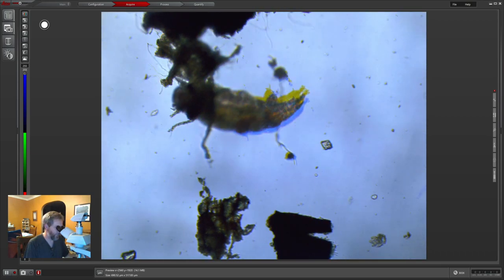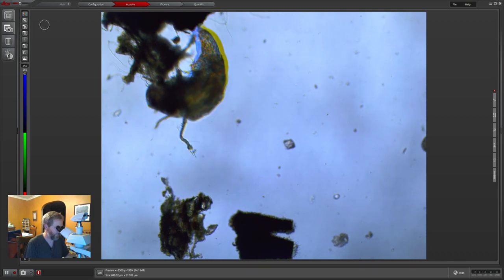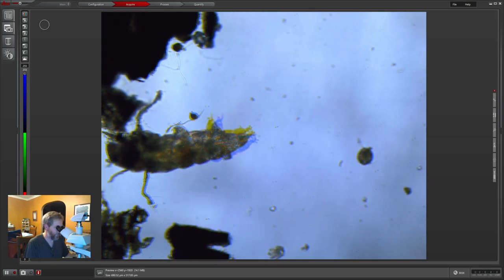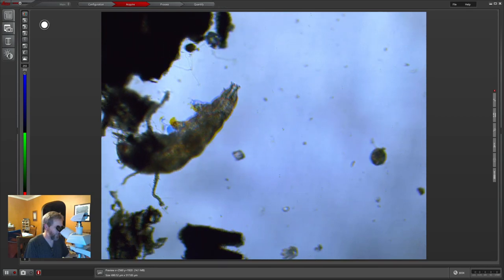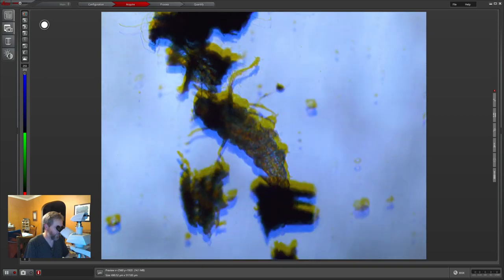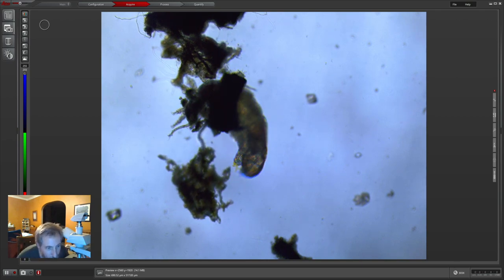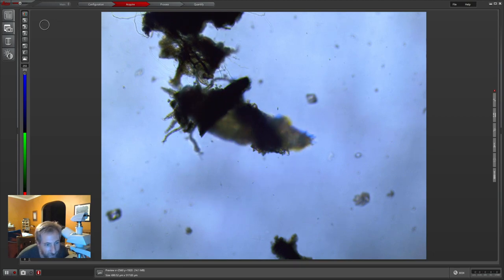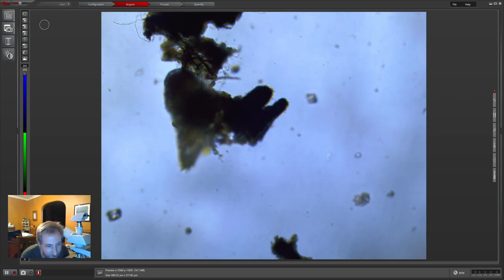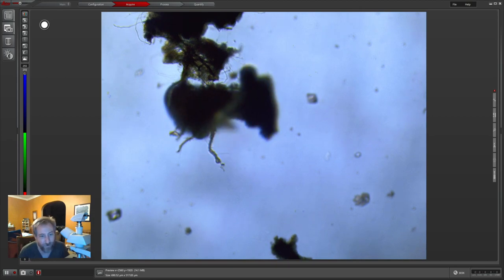Here's the actual water bear. You can see it's a little bit different than the kind we had before. It's got sort of a five- or six-star shape around its face, and then two little antenna-like structures coming off of its cheeks. We saw ones like this that were really small in one of the samples from my yard once, but this one is huge relative to those. You can really see it moving around. He's got little baby claws, and a little thing around the face, which is pretty cool.